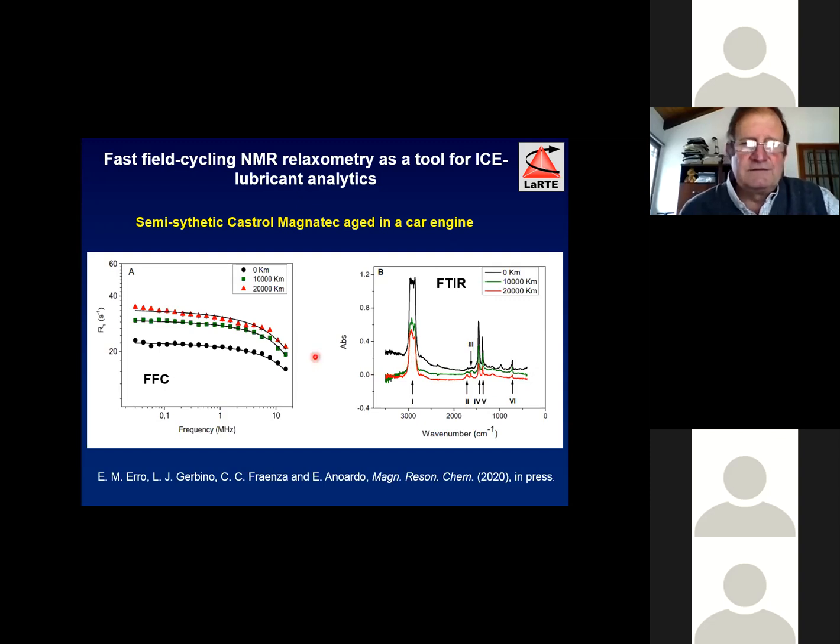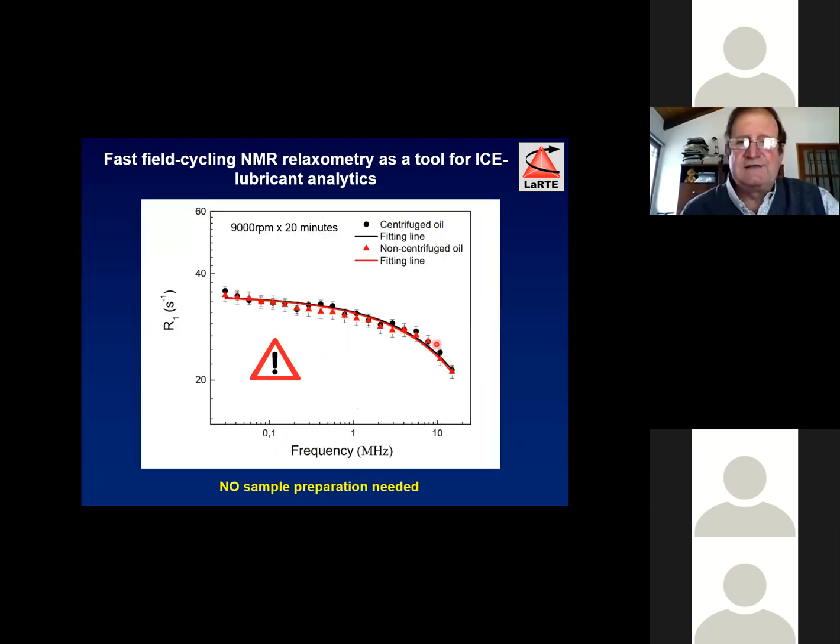And okay, so this is a main point I want to stress, because for several techniques, the samples should be prepared before the analysis. For example, you have to take out all the solid particles that are suspended in the lubricant by centrifugation or by solvent methods. Okay, solvent methods here are not allowed because you will change the chemistry of the lubricant for relaxometry. That could be catastrophic.